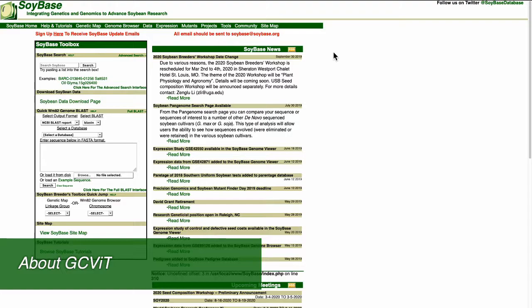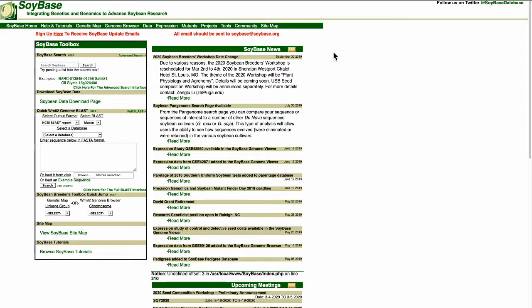So what is GCivit and how is it used? GCivit extracts information from a VCF file and does a pairwise comparison between two or more lines within that VCF file.